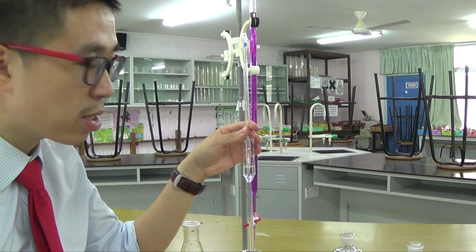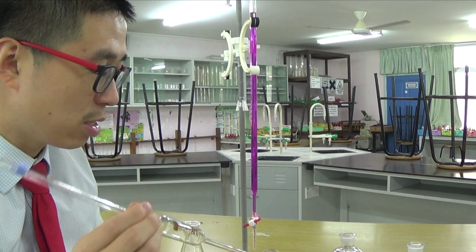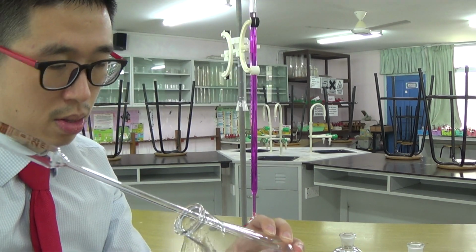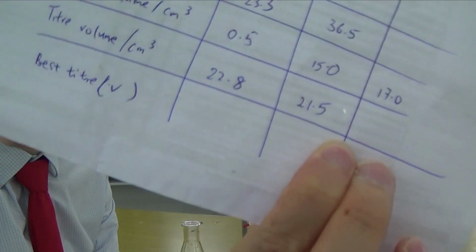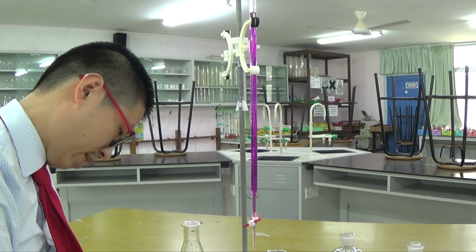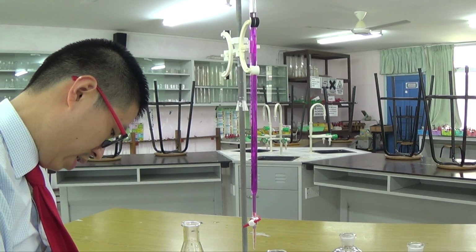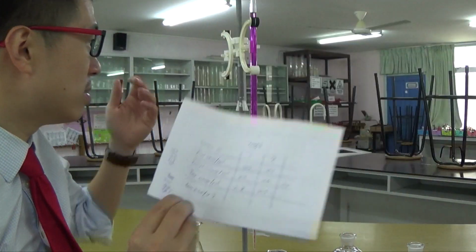You're doing an actual practical. You want your exact titer to be almost identical, as identical as possible to the actual value. So you want it to be like what just now? 21.5 was my exact titer. So 21.5 was my exact titer plus my 17.0. I don't have a calculator with me, but I can do this manually. So I should get 38.5 cm3 as my exact titer.